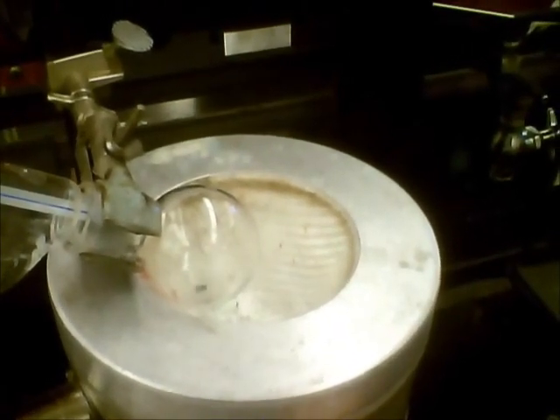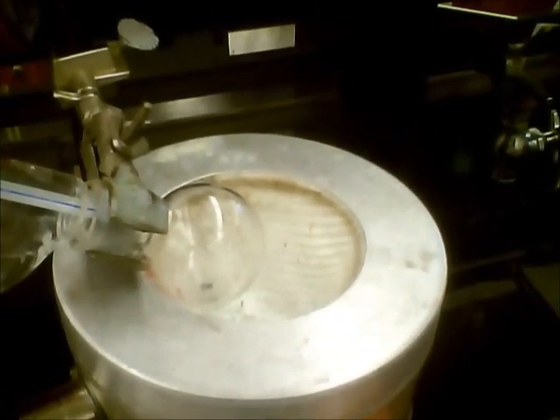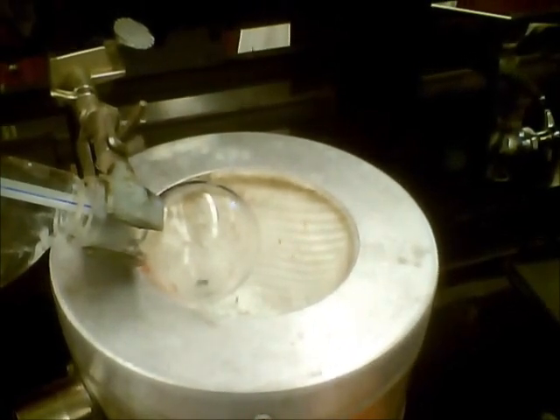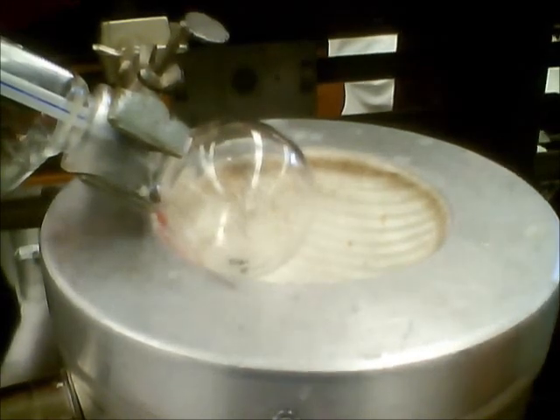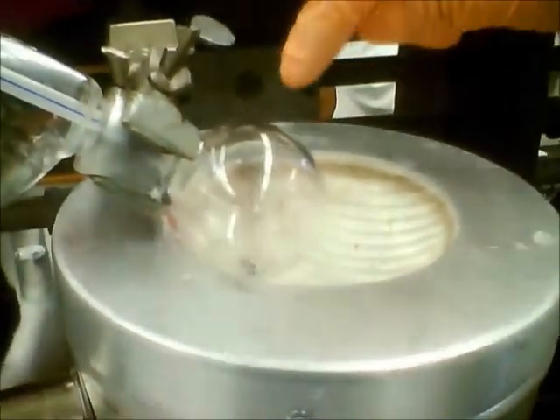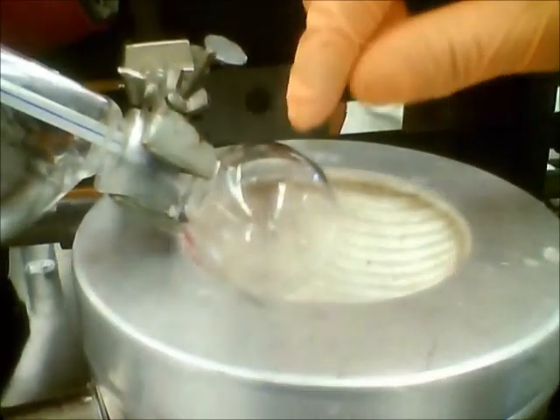It's starting to boil right now. If you can see it, it's going to actually be on the top here — and that's the reflux dripping back down.